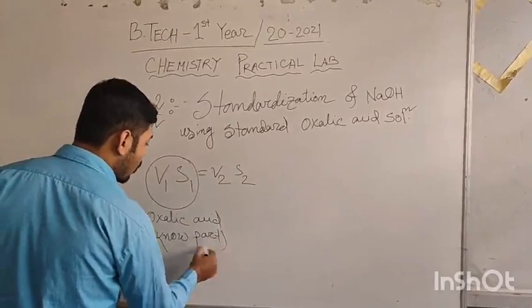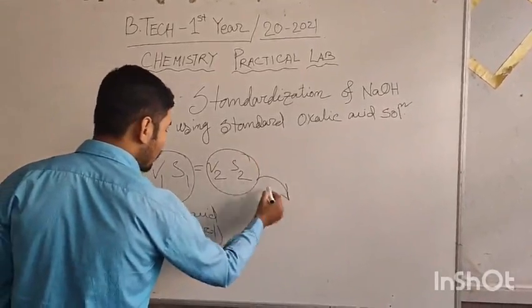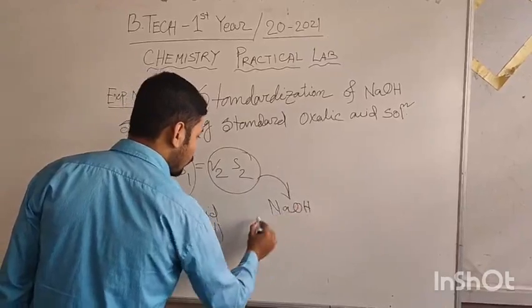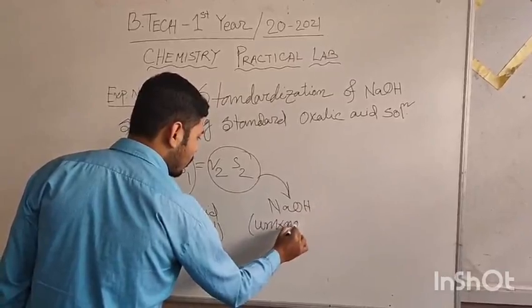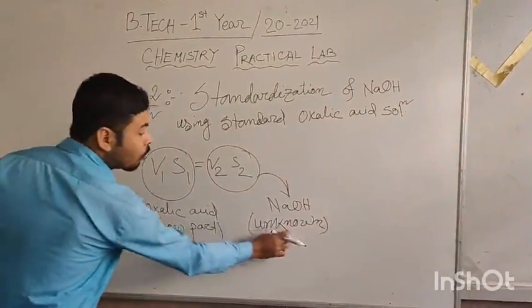And this portion you can take for NaOH, which is the unknown part.